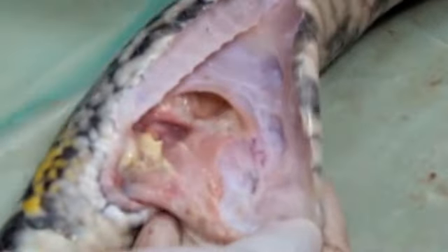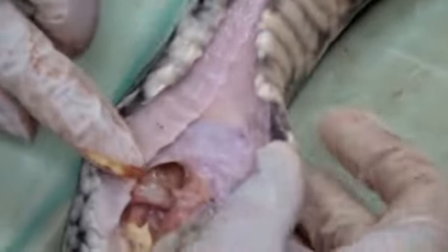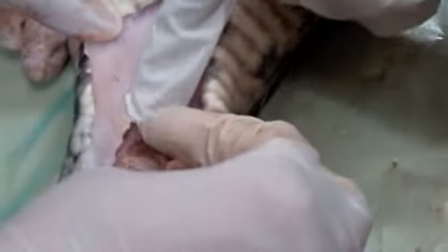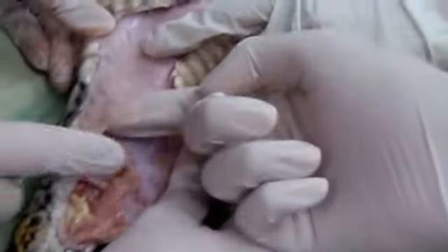I don't necessarily have to go fast, but I want to be careful. So you've got the subcutaneous layer here, and you're already seeing the ribs. Can you see the pokiness of the ribs? You want to feel the pokiness of the ribs before we peel that off? It feels like bone. It's so thin looking.